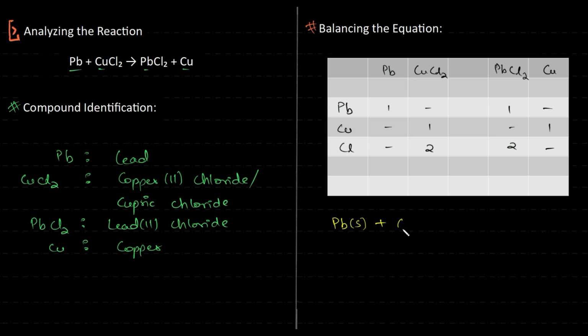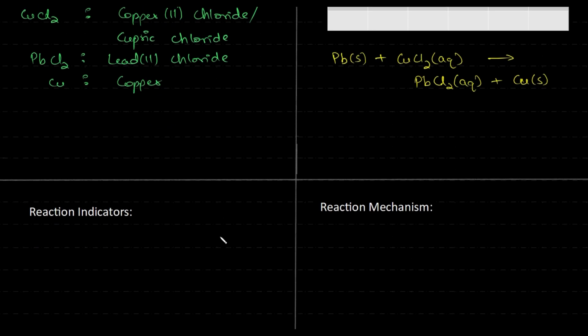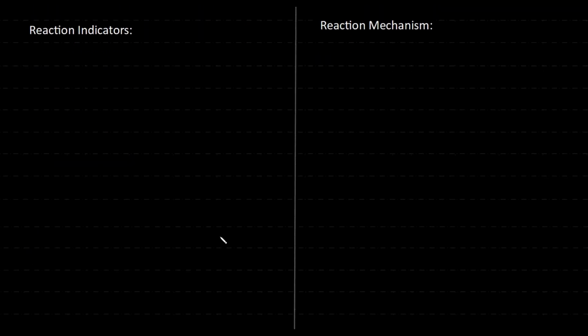The solid piece is dipped in your aqueous solution. This leads to, right, this being aqueous and this being your solid. So the lead displaces copper. There's no external agent needed for this to happen. That is spontaneous at room temperature basically. Okay, the most difficult part for you guys over here.